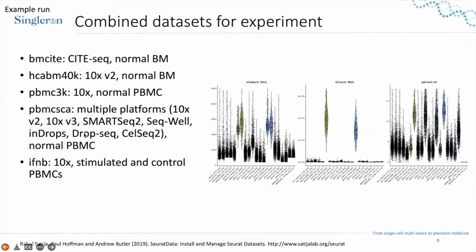For all of these example data sets, we did initial quality control to remove the potential doublets with a high number of feature RNA, removed the potential debris with a lower feature RNA, and removed the potential dead cells with a high percentage of mitochondria. As we can see here, before any batch correction, there could already be some heterogeneity or differences inside these samples or batches; the quality control metrics are quite different among those samples.